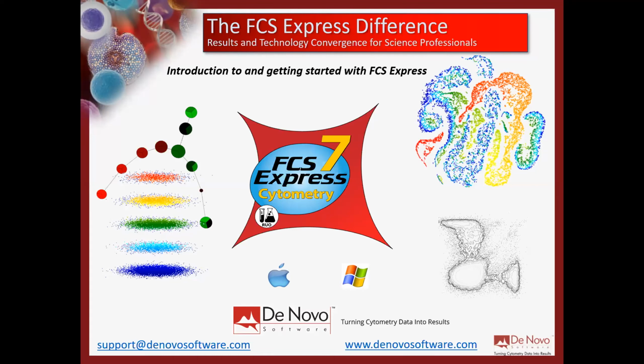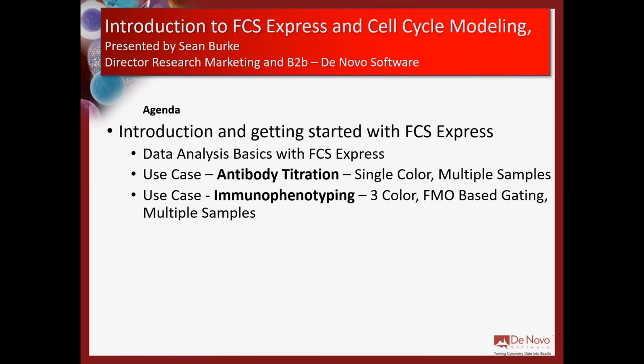Today's session on FCS Express is a bit of an introduction and getting started with the software. Usually when I'm doing these in person at Sloan Kettering, I'll ask everybody to raise their hands and let me know who's been using the software or not, so I can guide some of our analysis today. But I'll give everybody a little bit of an overview about FCS Express in general first for maybe about 5 minutes. I know everybody wants to dive into some data today. And then I'll show you my little agenda: we're going to go over some of the data analysis basics with the software. There are two different use cases and workflows that I'm going to cover.